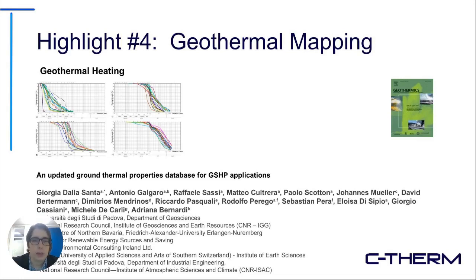Looking into the fourth application, we are looking at geothermal mapping. A very common application for thermal conductivity measurements in geological systems is looking at geothermal heating technologies, whether it's the near surface geothermal resources, or some of the deeper geothermal resources that can be exploited.